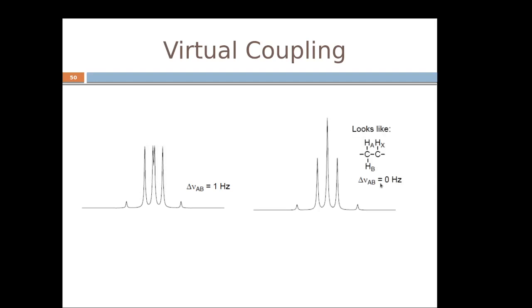And once you see that the chemical shift difference between A and B nucleus is 0 Hertz, that means the A and B nucleus become absolutely isochronous, with the maximum possible chemical equivalence. Then we can see that the central peaks are completely merging with each other, forming a single peak with a slightly higher intensity, and resulting in an overall peak pattern that resembles a triplet.